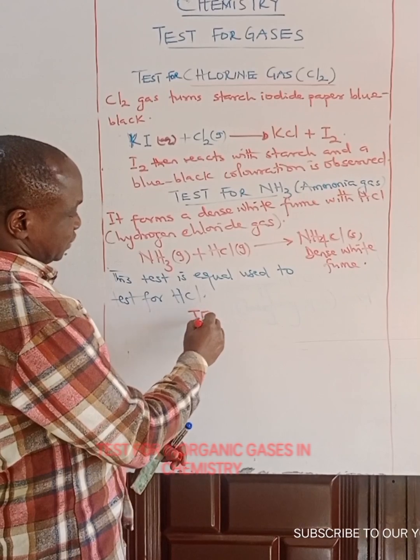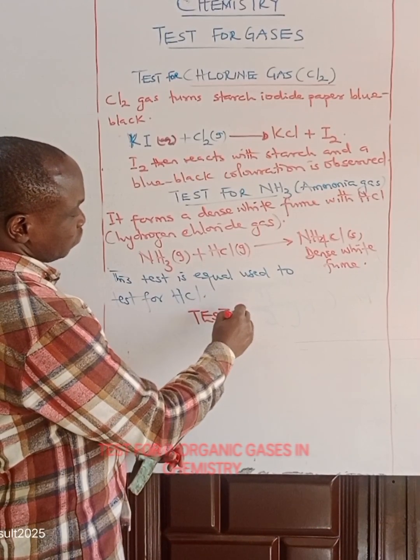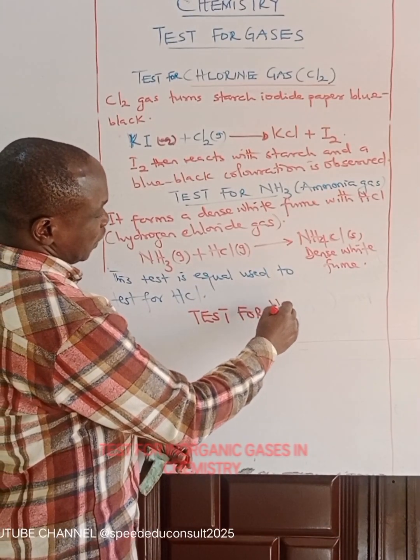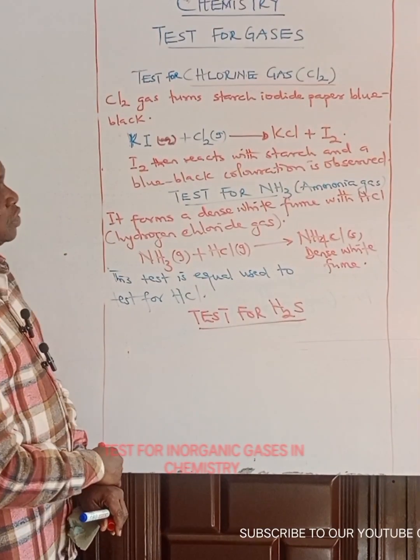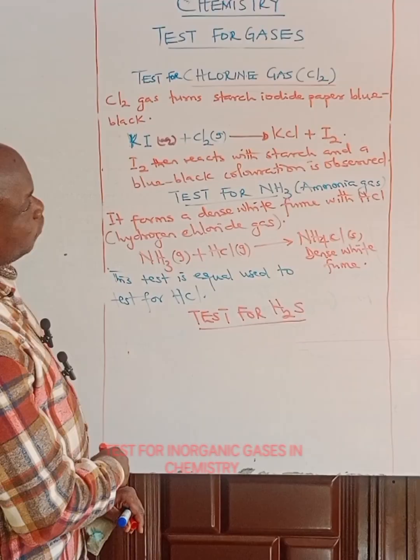Let's see the test for hydrogen sulfide. Test for hydrogen sulfide.